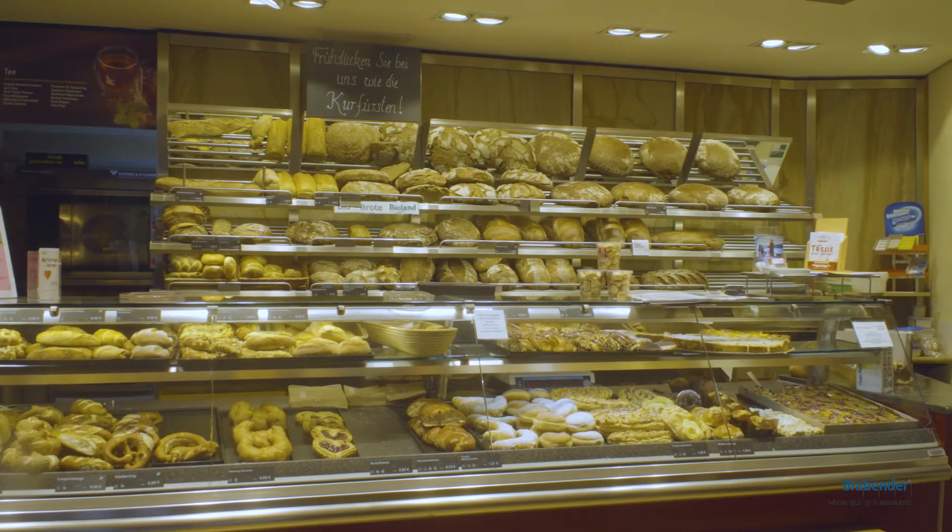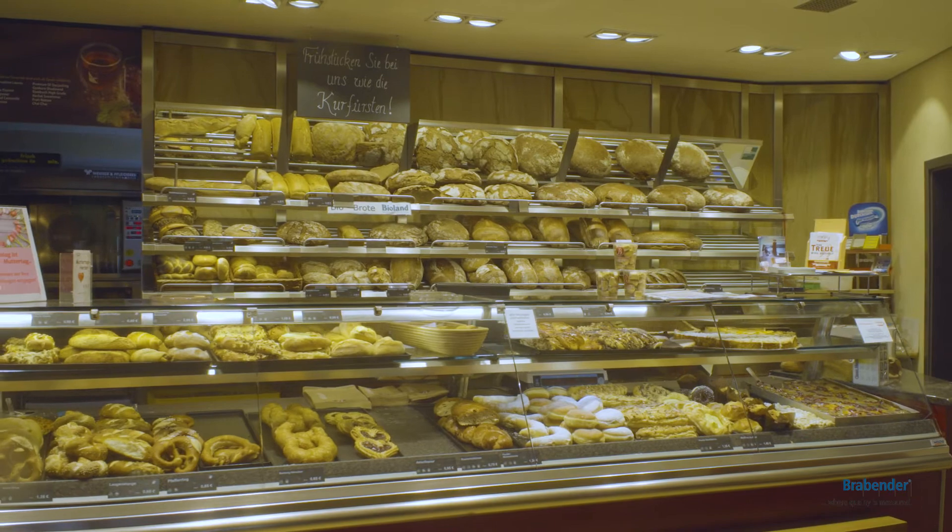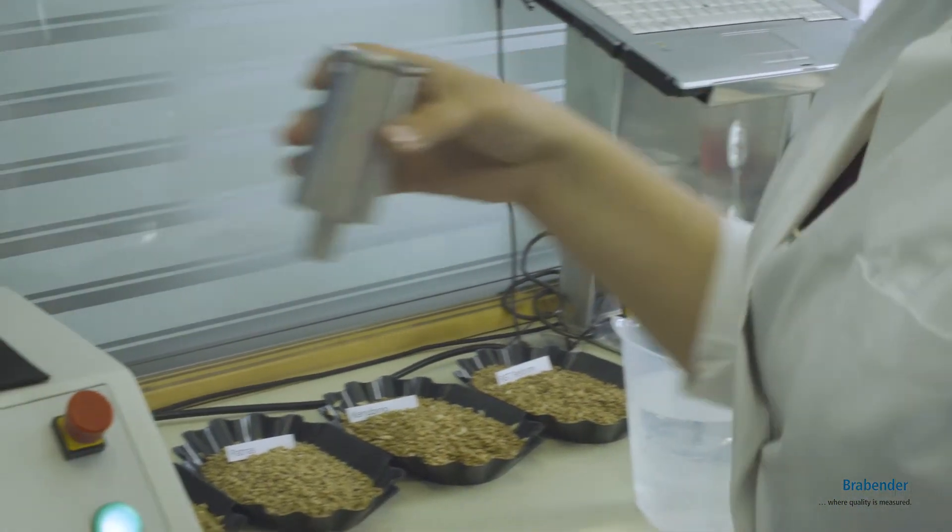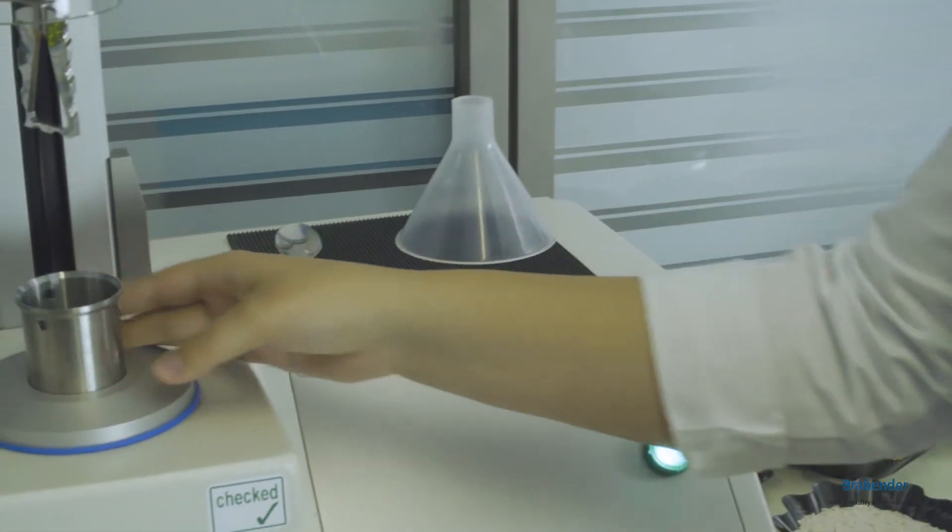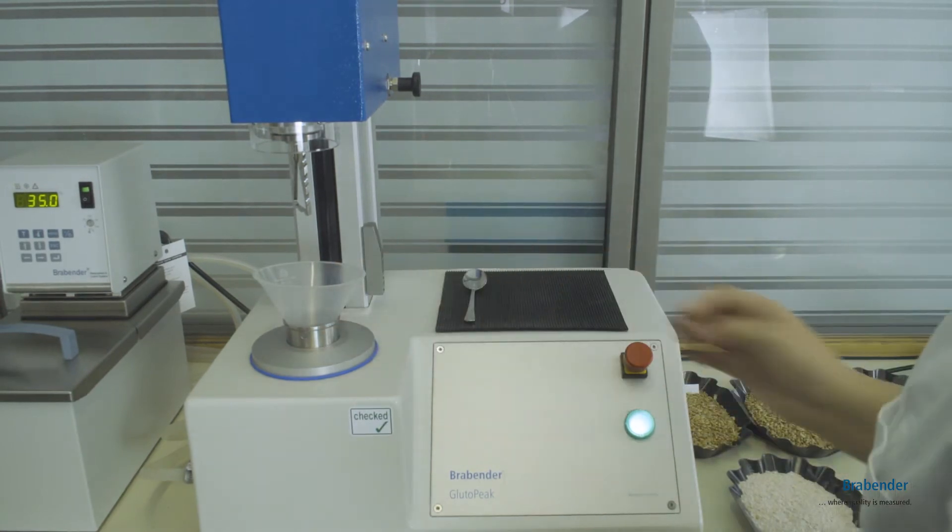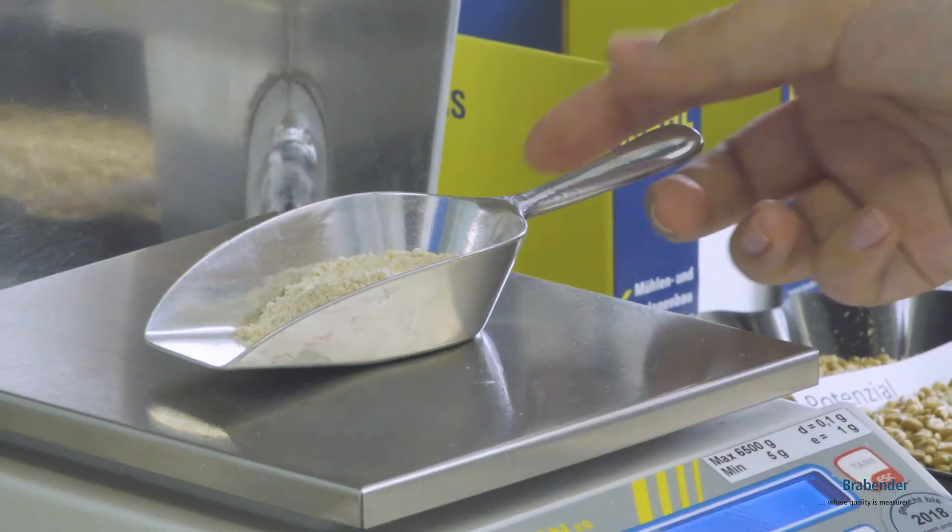As well as specialized wholesale traders for bakeries and pastry shops. In order to promptly evaluate the delivered grain batches or loads during harvest time, the Brabender Gluto Peak has complemented the laboratory of the Wiesnet Mill since summer 2016.